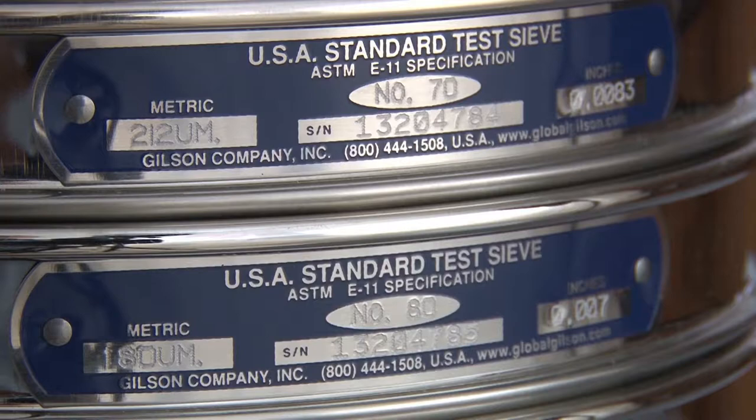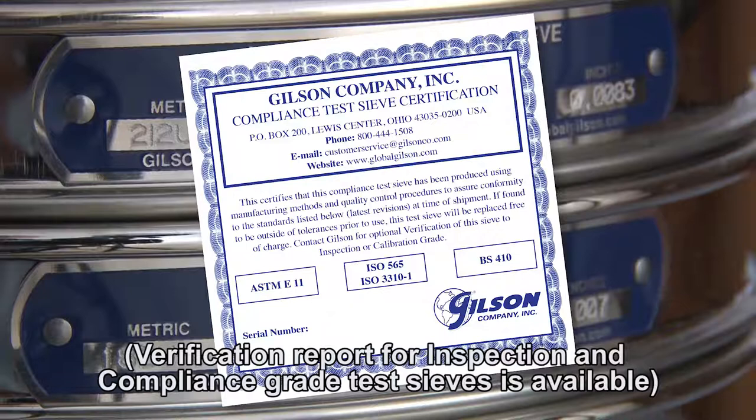Each Gilson sieve is serial numbered and comes with a manufacturer's certificate of compliance to the appropriate standard.